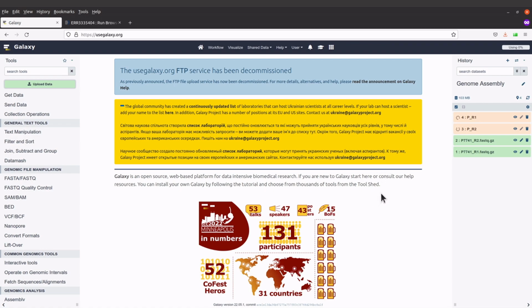The PR1 and PR2 are being fetched because for these we are using the link, so Galaxy will download them to your account for you. Those are currently loading, but these ones we uploaded from our local PC are successful. So the files have been fetched for us.